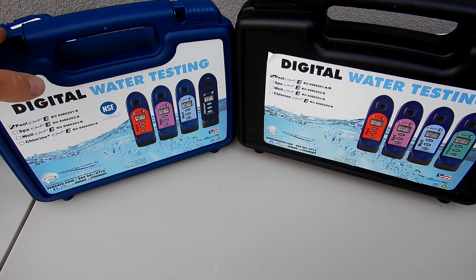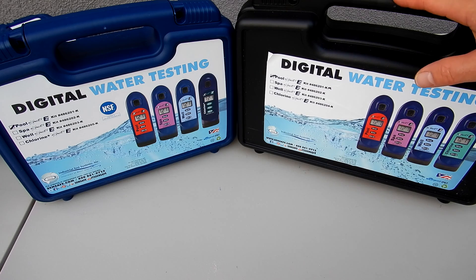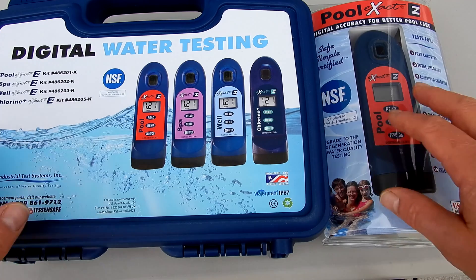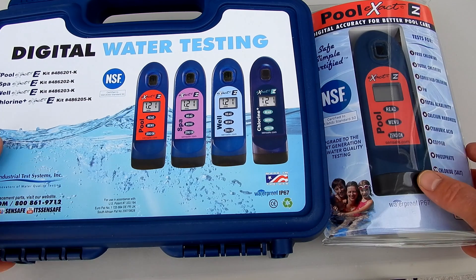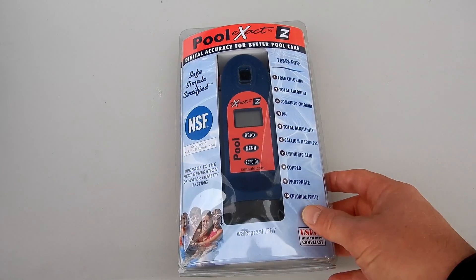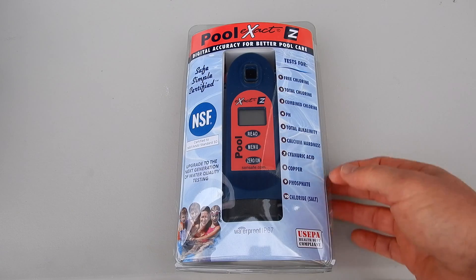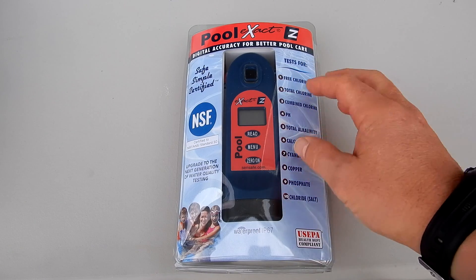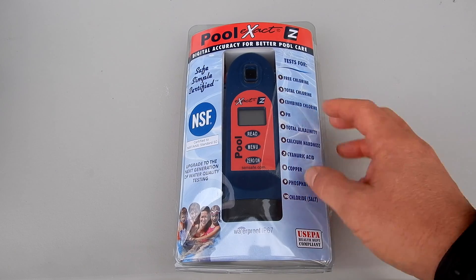I'll cover both of these kits in more detail in their own separate videos and walk you through the test factors using both kits. And if you think you don't need the whole kit but want the exact easy photometer to run your test factors, you can buy the exact easy by itself without the kit. The pool exact easy does all ten test factors, but you would have to purchase the exact strip micro for each particular test you want to run.